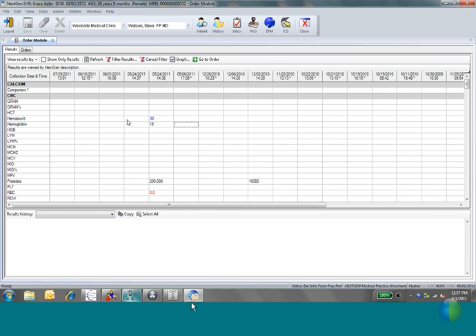Once you can see the results, you can actually click on an individual test as well, or an individual result. So in this CBC, I clicked on the hematocrit, from 5/24/11, and it loads the information down below. So I can see the result is 30, the result status is final. I can see that it was considered a low result because the normal range is 34 to 50. And then this one didn't have any comments on it. So again, clicking on the individual result will give you some more detail about it.